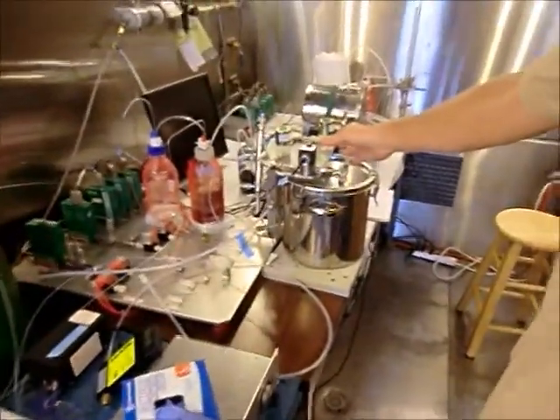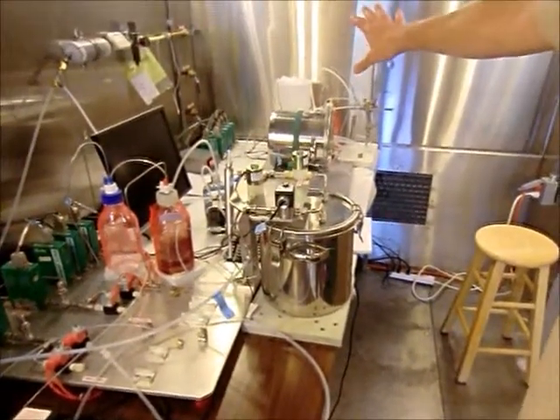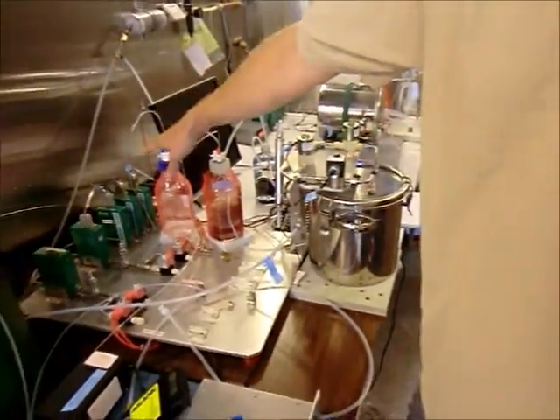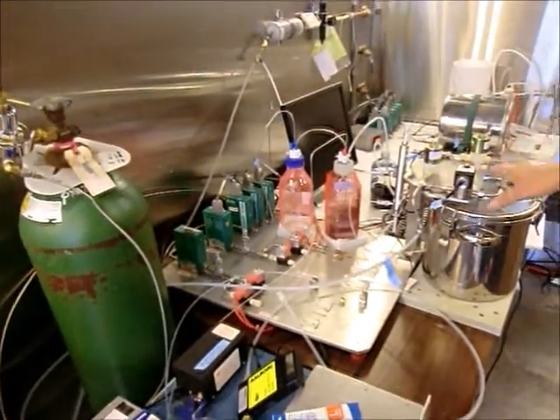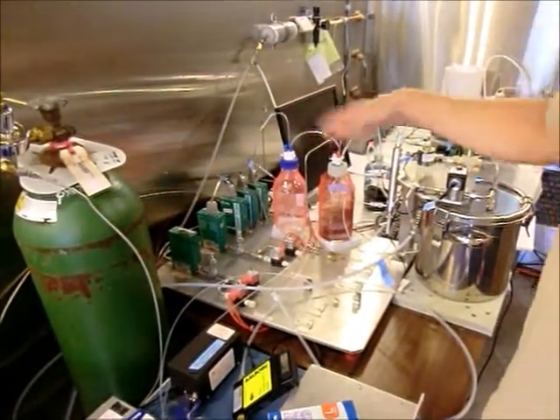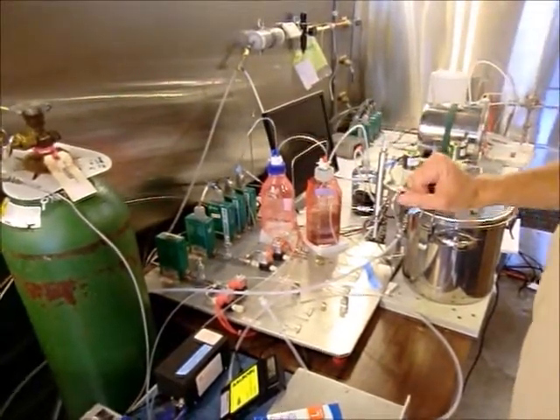This chamber here is the chamber that we use for ozone deposition velocity studies. The one over there is used for a completely different set of experiments. Here are mass flow controllers. These control the rate at which air flows through the reactor. We can use this bottle of water here to humidify the air and adjust the amount of humidity by mixing gases through there.